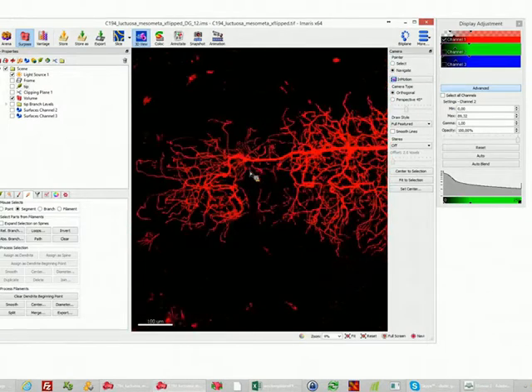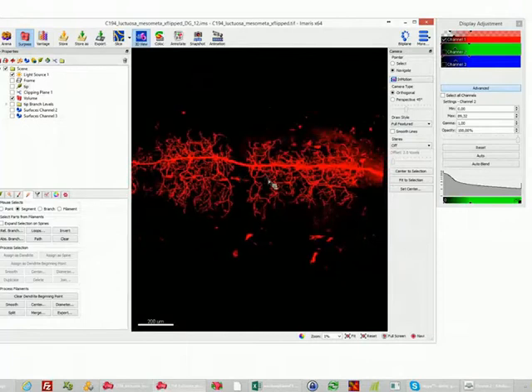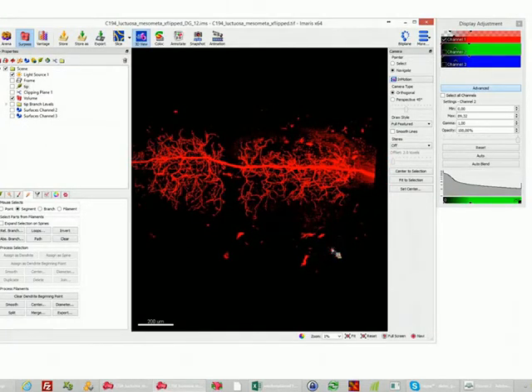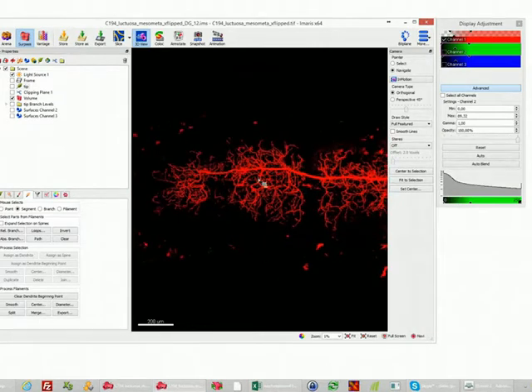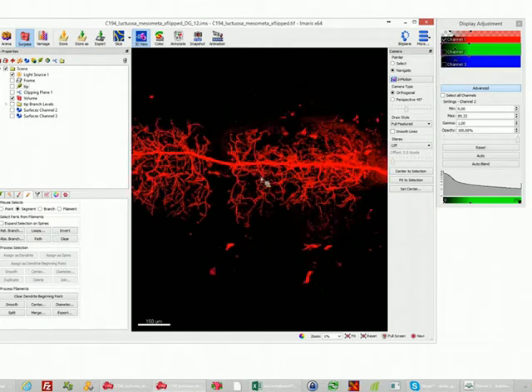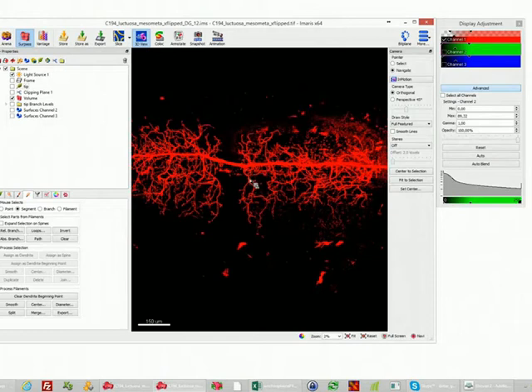So to overcome these differences, what I did, I did the reconstruction in 2 subregions. So first, I did this subregion, and then I did that subregion, and tuned the parameters for the different regions a little bit, so we could get nice results, even with the automatic detection. And then in the end, I just joined these 2 vector objects, which is quite easy.